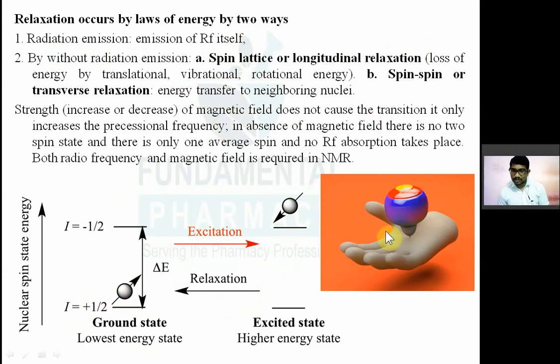What happens here is like a top. All of you must have played with a top in childhood. When you spin this top, initially it spins on its own axis, when it has a lot of energy. Later it starts to wobble a little to the side. The sideways motion is called precessional movement, and the frequency at which it spins in the precessional orbit is known as the precessional frequency.